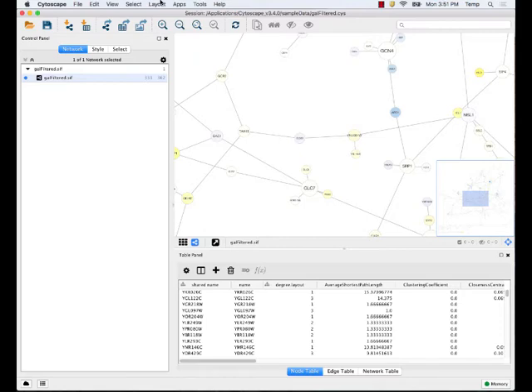The force-directed layout algorithms model network nodes as repelling forces — like like-charges pushing away from each other — while the edges pull nodes together. Nodes that are connected are pulled together, but they also repel each other, so they bounce around into a balanced position. This reduces overlap so nodes aren't on top of each other, and edges have fewer crossings. Otherwise you get a hairball where everything looks connected to everything else. These algorithms try to identify major structures, grouping highly connected regions together.